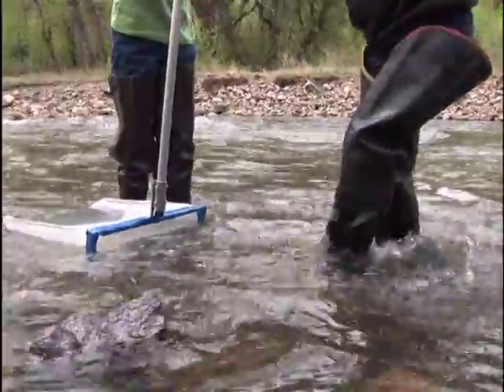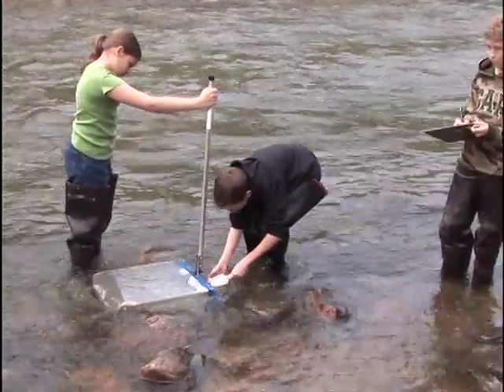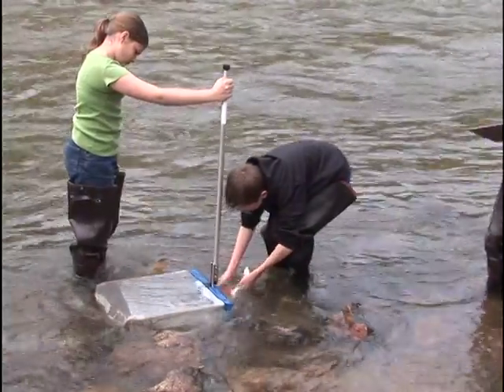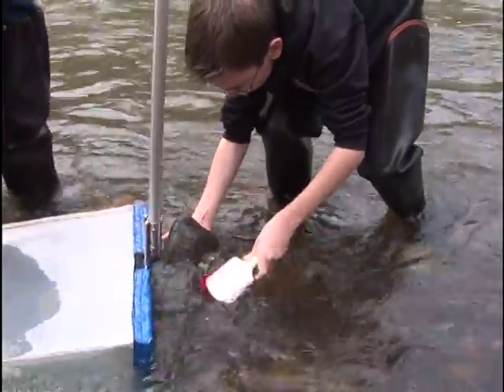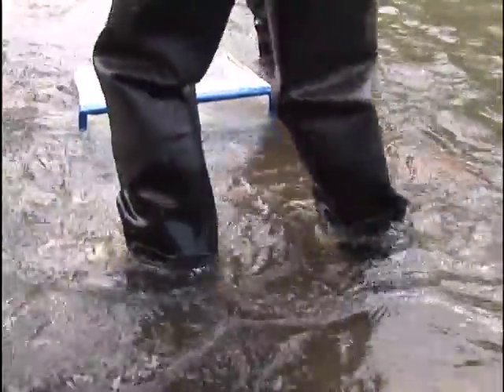Do not kick the larger substrate out of the way. Larger rocks or debris, such as logs, vegetation, and even trash, should be picked up and brushed immediately upstream of the net so bugs will flow into the net. The goal is to get all of the bugs and smaller debris from your kick area to flow into the net.